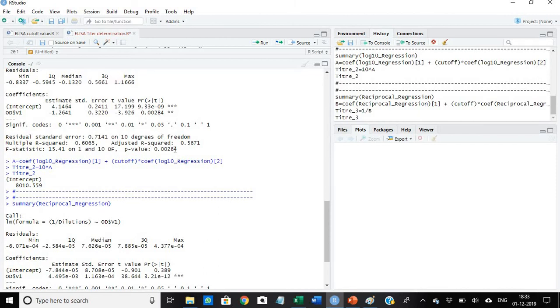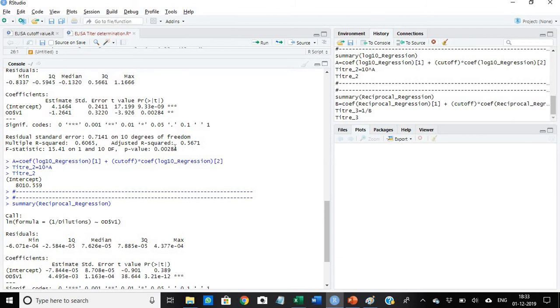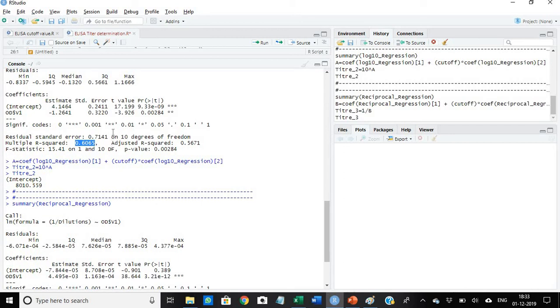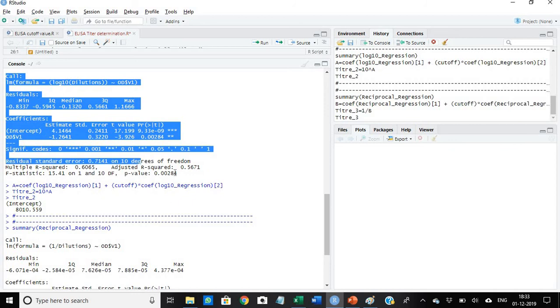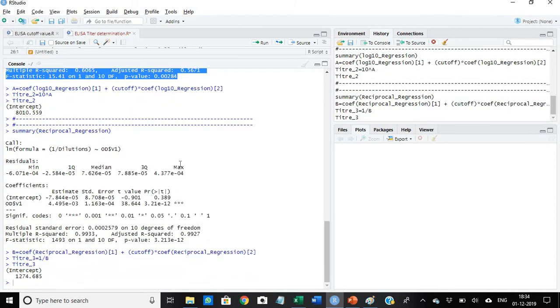Now we go to the second one, this is the log regression. In this case what we observe is that the p-value is less than 0.05, which is okay. But the problem is with the r-square value, which is 0.6. This also we cannot take because although the p-value is less than 0.05, the r-square value is very less. It should be above 0.7, so we cannot take this log regression.